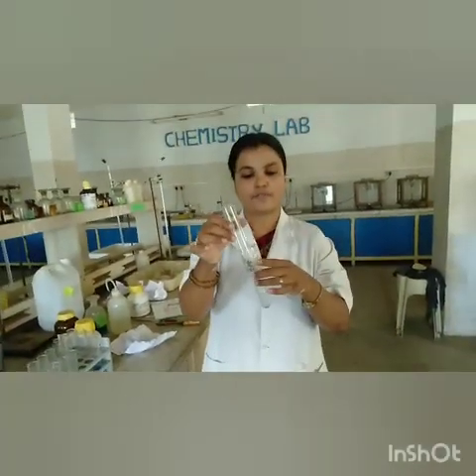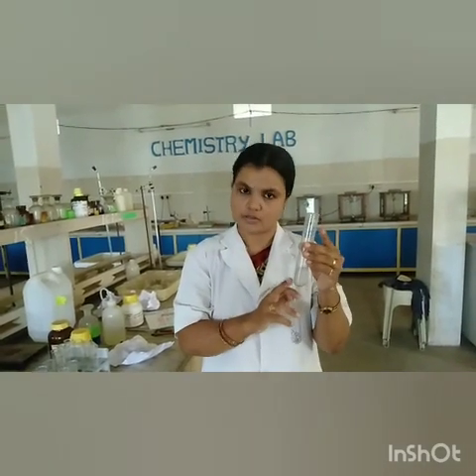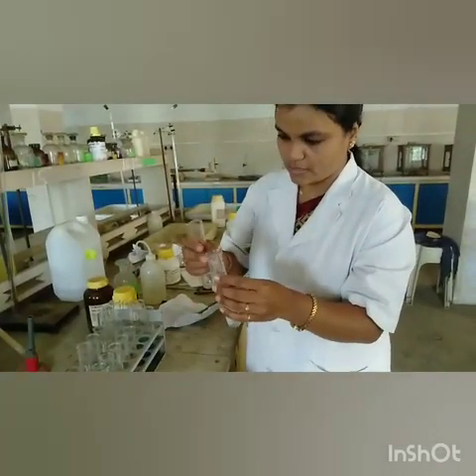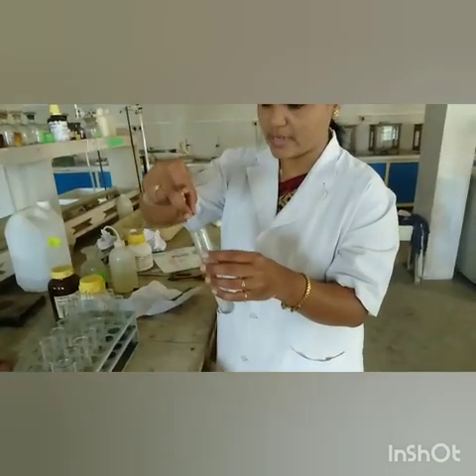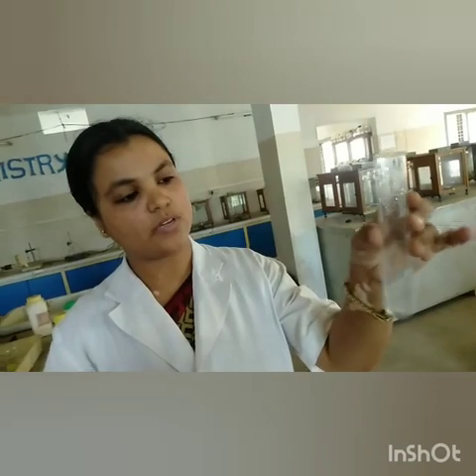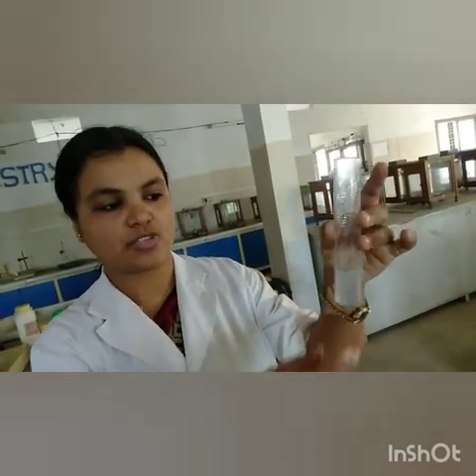So I'm going to add a few copper turnings into the zinc sulfate solution over here, and let us see what could be the reaction here, children. As you know that copper is much below in the metal reactivity series, you will see that absolutely there is no visible change in the reaction.